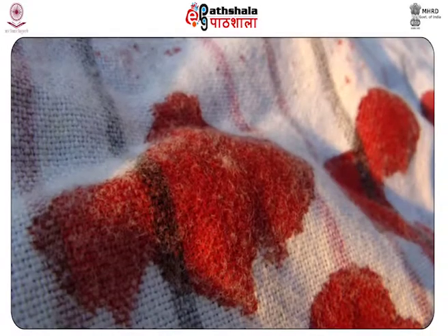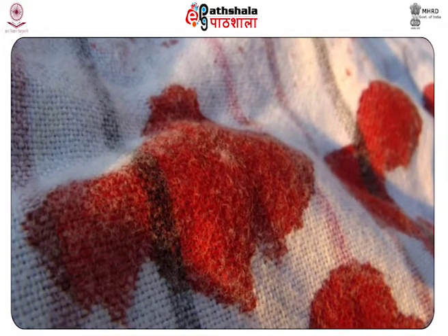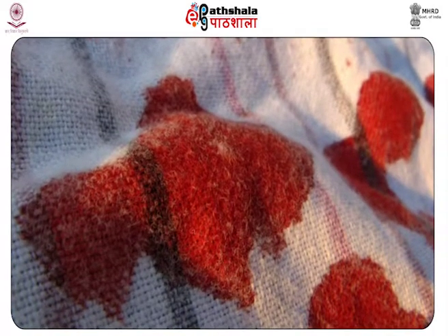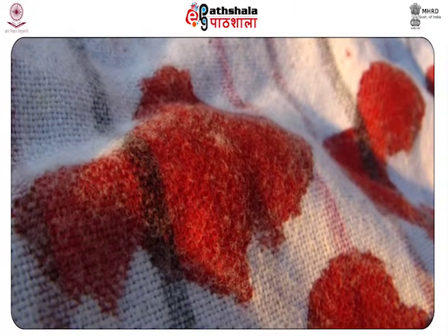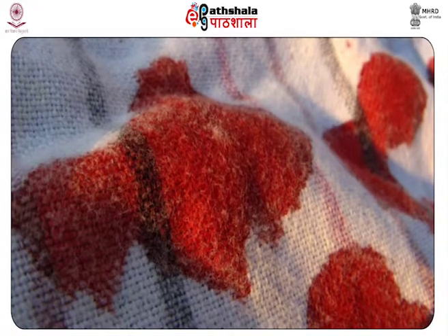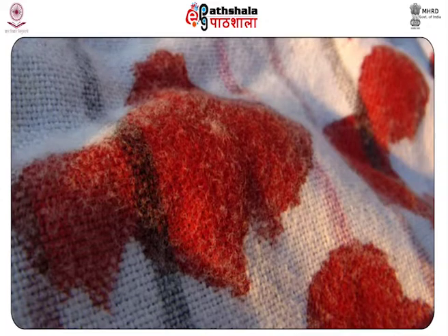If the blood in the pool has dried, about 3 grams of the dried blood is collected. If the blood in the pool is a sticky mass, a piece of cloth is stained in the center of the pool, dried and packed as usual along with the 3 grams of dried blood.